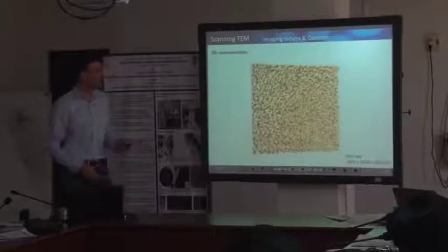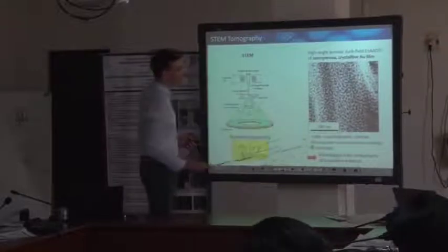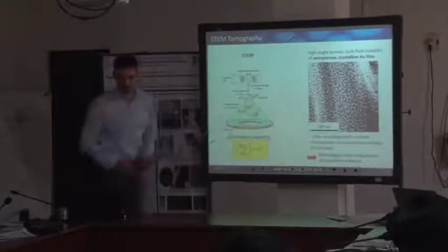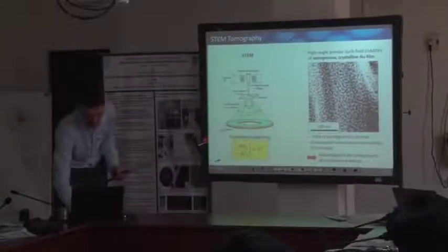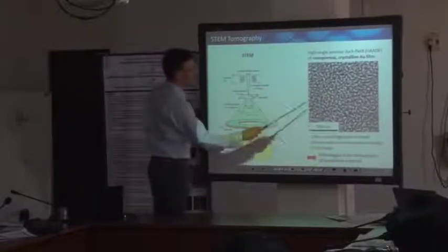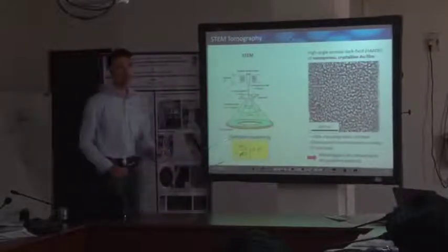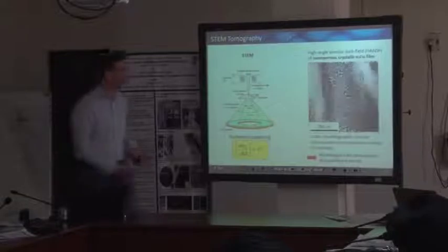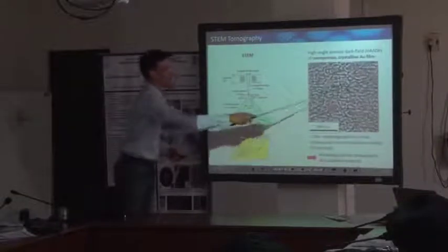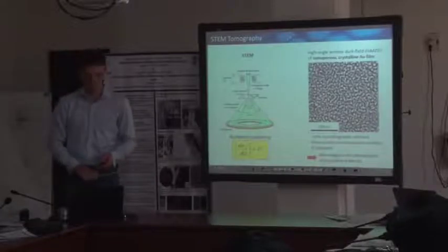This is just another example, and here, this is already high-angle dark field, and in principle what you see here is that there's hardly any contrast fluctuation. I mean, this is single crystalline, you see some broad contrast variations in the back, but in principle you get a really good contrast of the gold, which is bright, compared to the vacuum, which appears dark in this contrast range.